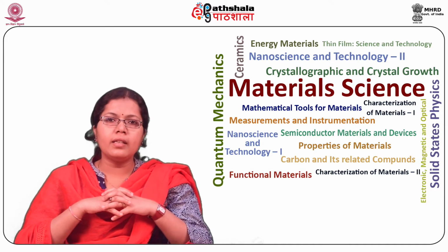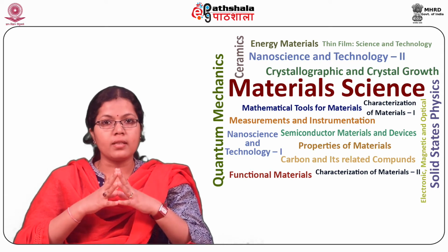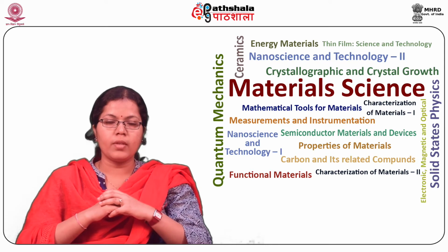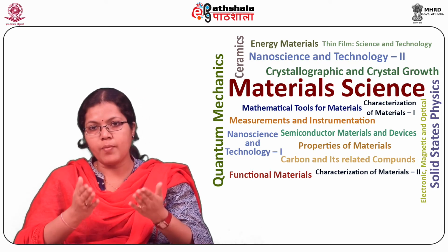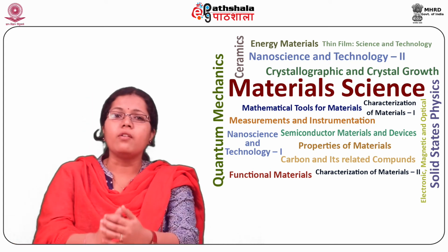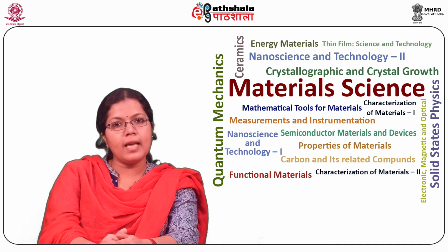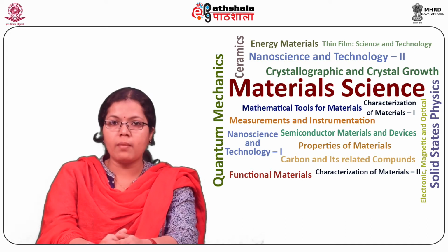More than any other cathode design, the field emission tip is extremely sensitive to the size, shape, and surface condition. The work function of the metal is responsible for the emission process. This work function can be affected by the adsorbed gases. This is the reason for the very high vacuum requirement.